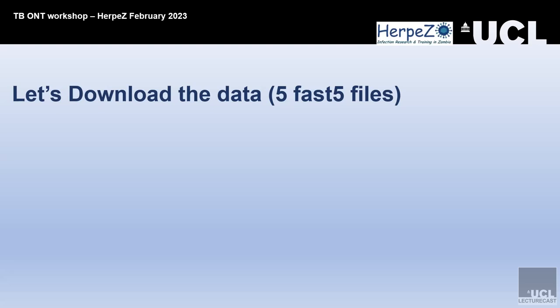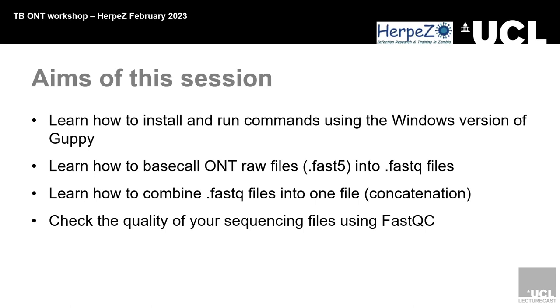The aims are to learn how to run and install the Windows version of Guppy, to learn how to base call the raw data, the Oxford Nanopore data which is a fast five format, and convert those to fastq files, learn how to combine fastq files through concatenation, and then check your sequencing results to QC them using FastQC.